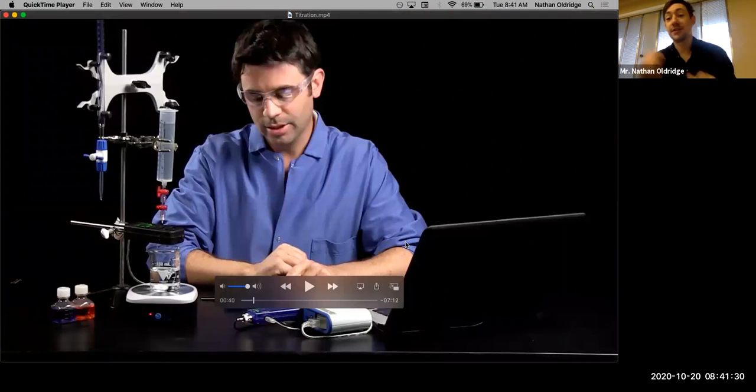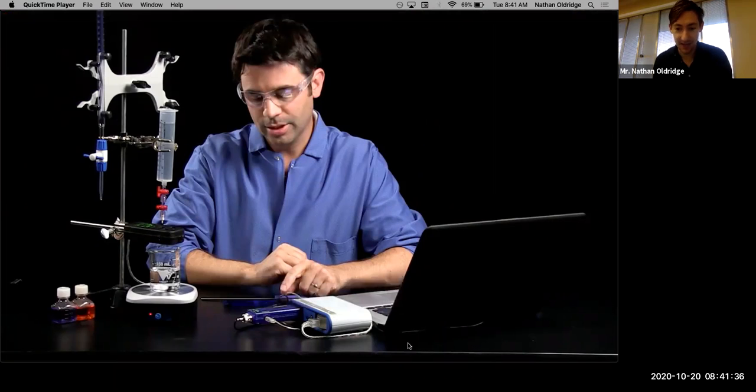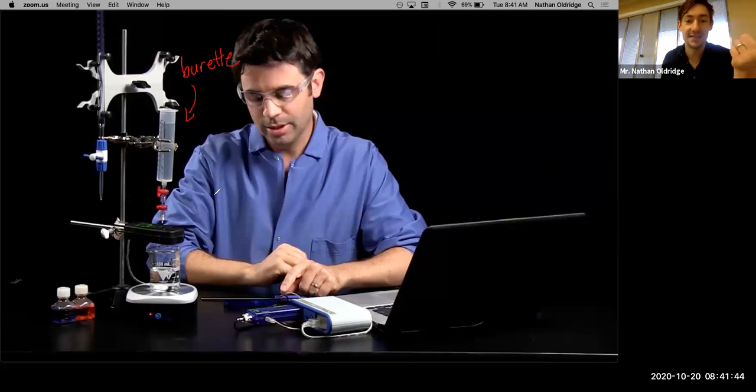This guy, I'm going to talk over him because he's not the most exciting man, but that's okay. What he's got here, I'm going to turn on my annotations. What he's got here is called a burette. Now, his is made of plastic, and the ones we have here at the school are made of glass, but they are built the same way. They have all these little demarcations that tell you how many milliliters of fluid is inside.